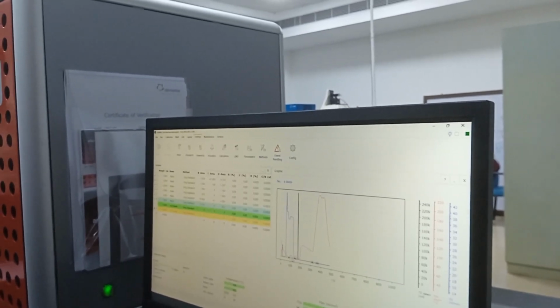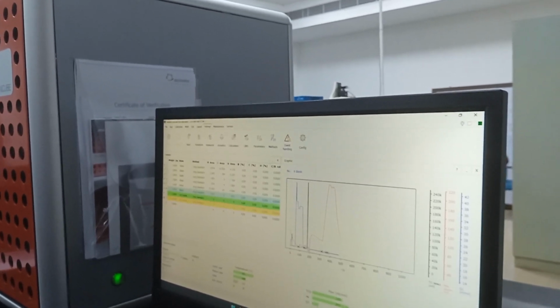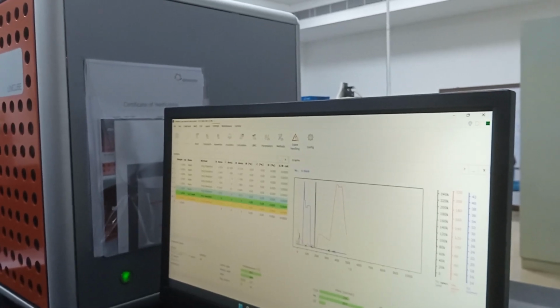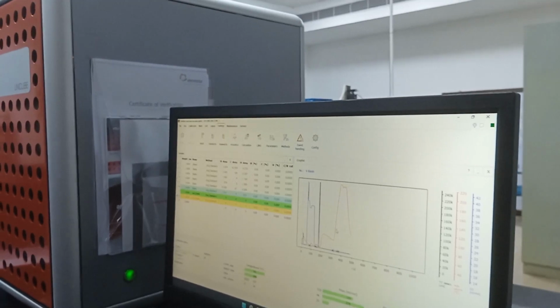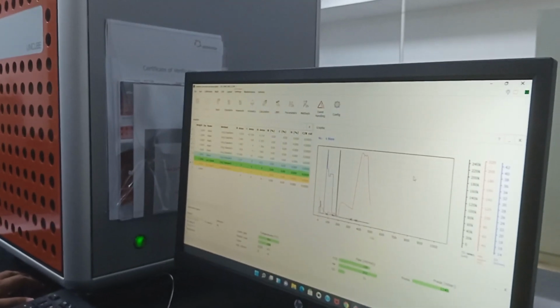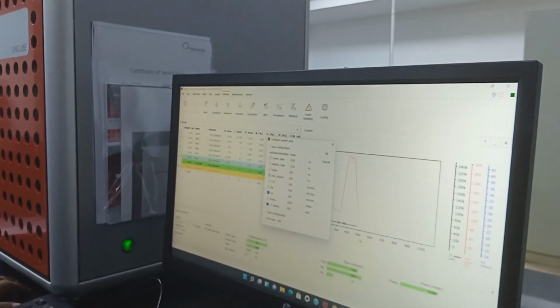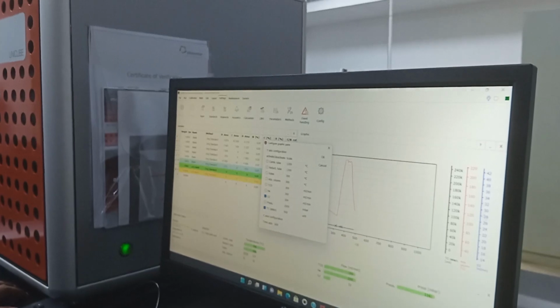The column temperature, as I told, for nitrogen it will be at room temperature. For carbon it increases. For nitrogen it increases, the same thing. Whether it is increasing or not, for my confirmation, I have enabled it. That's it. If you don't want that one, you can take it out. And this is the O2 dosing.